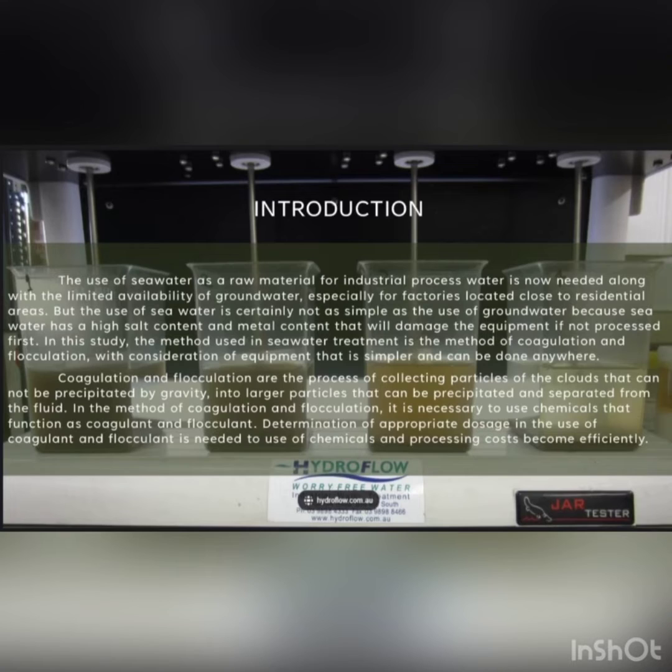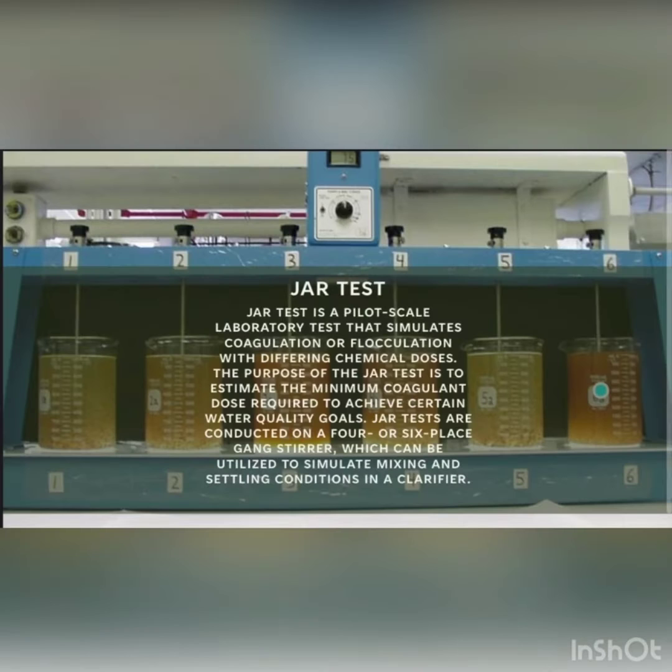Coagulation and flocculation are the process of collecting particles of the clouds that cannot be precipitated by gravity into larger particles that can be precipitated and separated from the fluid. In the method of coagulation and flocculation, it is necessary to use chemicals that function as coagulant and flocculant. Determination of appropriate dosage in the use of coagulant and flocculant is needed so that the use of chemicals and processing costs become efficient. We conducted a jar test for this experiment.